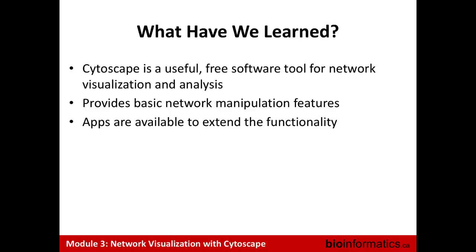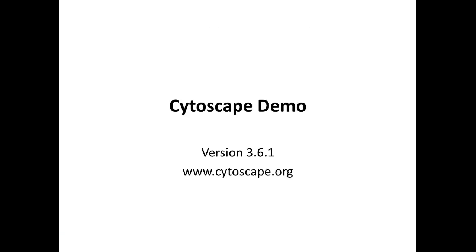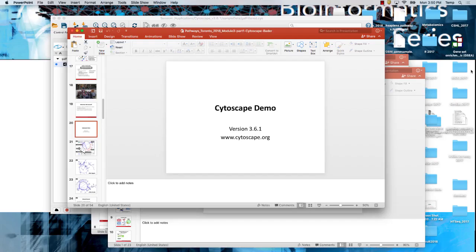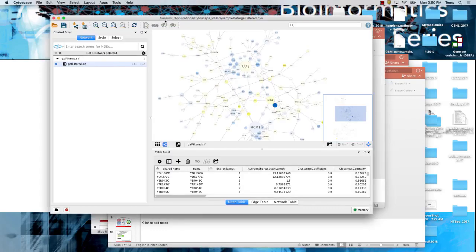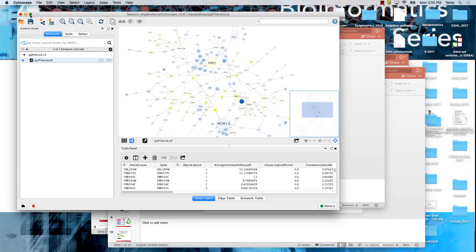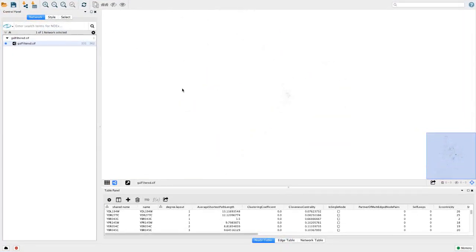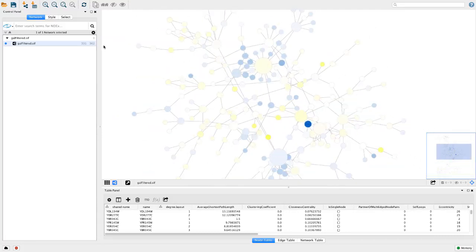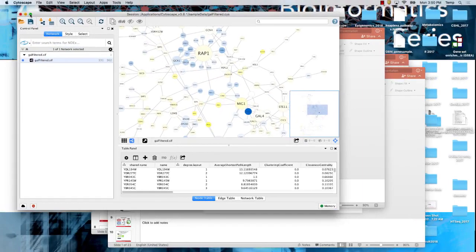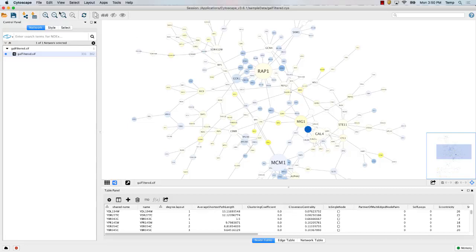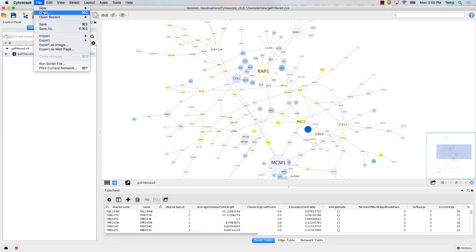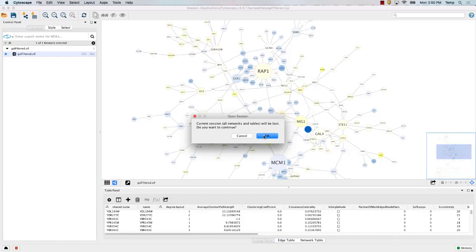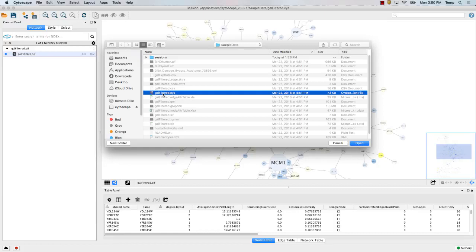The main point: Cytoscape is a useful free software tool for network visualization and analysis. We're going to use it in the next lab and also tomorrow. The latest version is Cytoscape 3.6.1. To show how Cytoscape works, I've loaded up a sample file — galfilter.cys — that comes with the Cytoscape sample data directory. It's a yeast protein interaction network that has a bunch of information preloaded, useful for demos. The .cys extension is a Cytoscape session file.